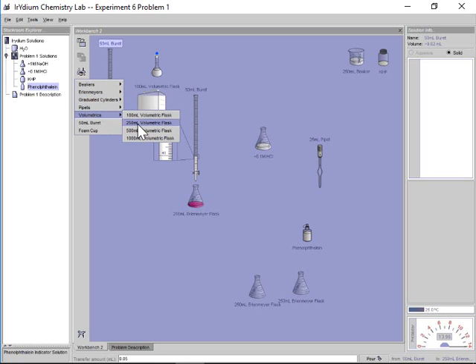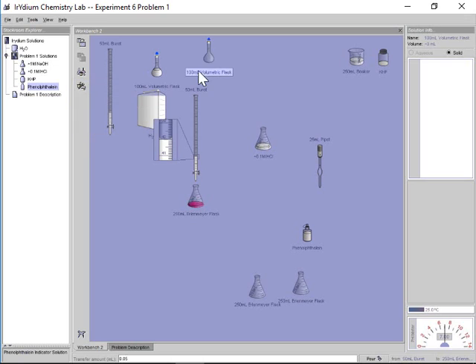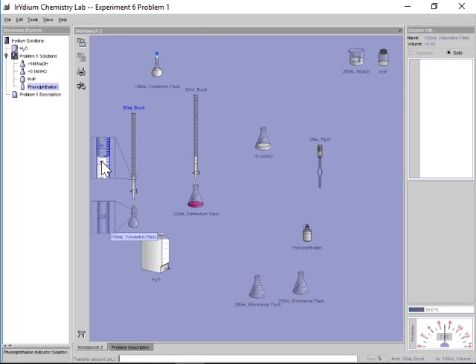So let's pull out a volumetric here. You see a lot of this lab work is just trial and error. So what I'm going to do is I have what looks like 9.62. I'm going to see what's left over on my markings here. I have at least 8 mils because I know I have at least down to the 50 mil mark. I don't want to go beyond that 50 mil mark because I don't have markings at this bottom part. So you might actually have some extra volume there, but I wouldn't be able to calculate how much volume there actually is. So let's just transfer in 8 mils because that's safe.